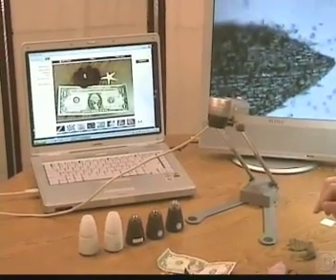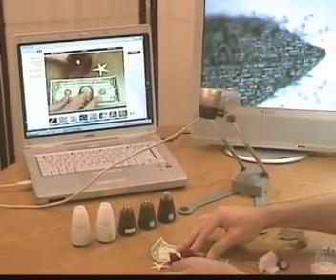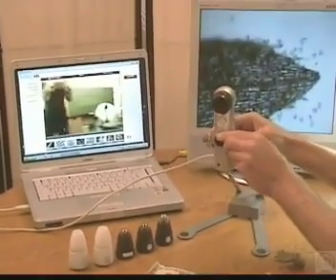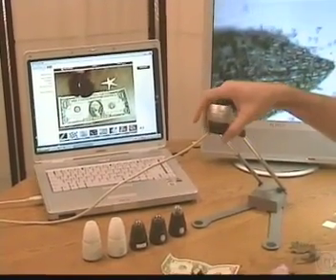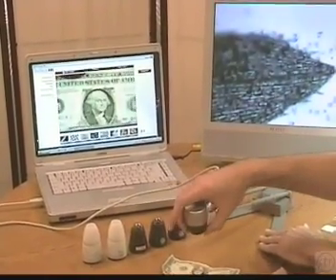The first is the stand and view mode. You can put the ProScope on this optional stand and then display any object or point it out across the room for a presentation, or use it like a dissecting camera or a document camera. This is kind of manual focus here so you can zoom in directly on any object you want to view.